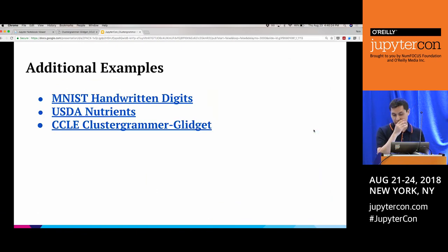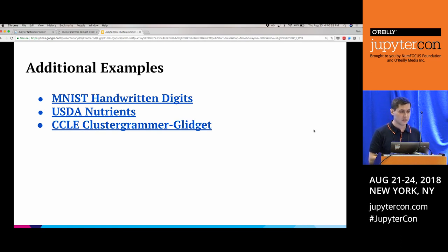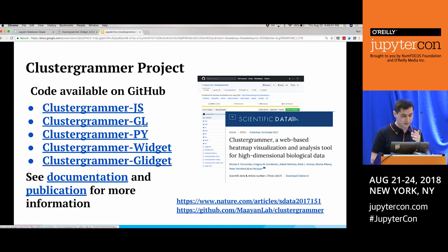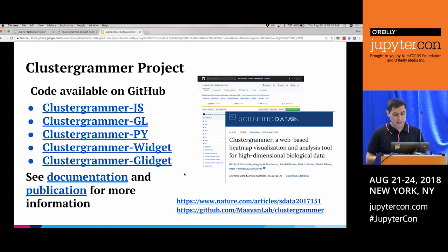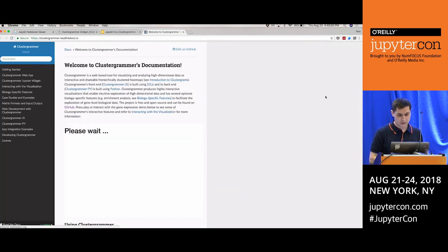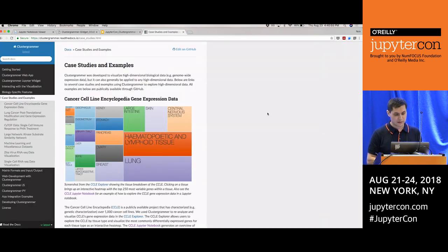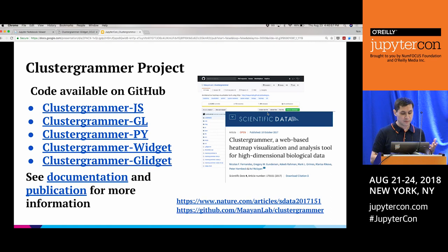There are links to additional examples including the MNIST data set and a fun USDA nutrients data example, as well as the CCLE WebGL example. The project is open source: the JavaScript libraries are ClusterGrammar-JS and ClusterGrammar-GL for WebGL, ClusterGrammar-PY is the Python backend, and there's the widget and new WebGL glwidget. Documentation is on Read the Docs, it's pip-installable, and it was recently published in Nature Scientific Data.